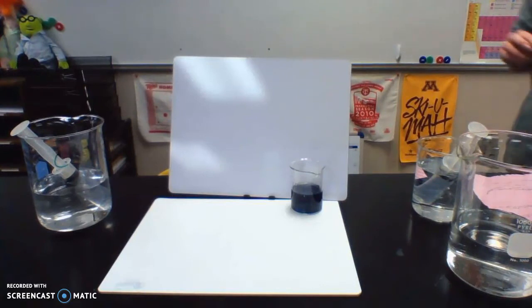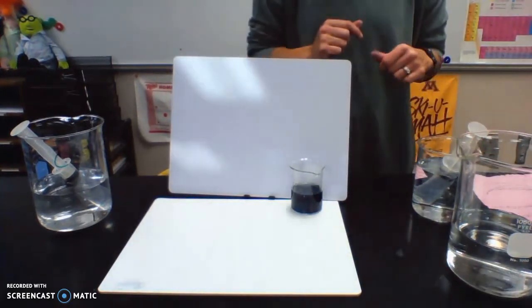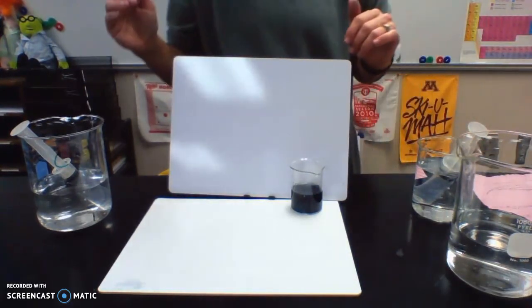There we go. This one seemed to take a little longer.